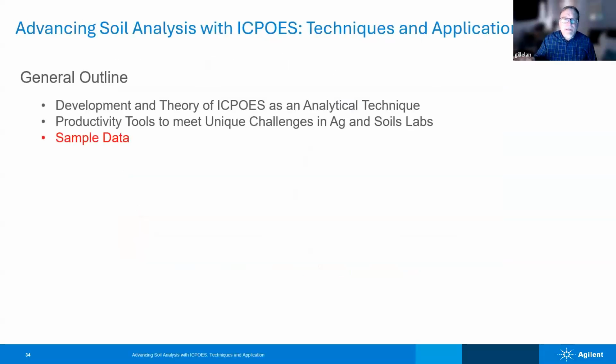Now, I'd like to jump into some data from some samples. I have over the last few months run some ag samples, some soil extractions, and we've got some soil data in general that has been digested, or soils that were digested. So we'll take a look at some of this, and I'll discuss the results. And then after that, I think I'll turn it back over to Corey and we can open things up.